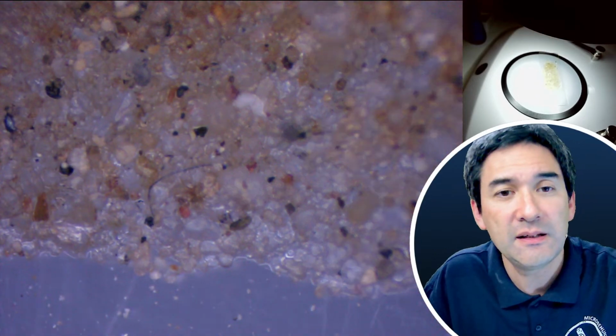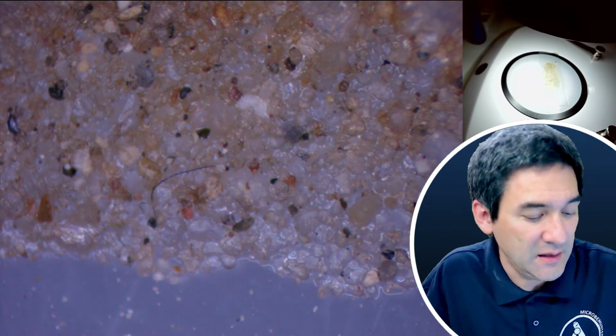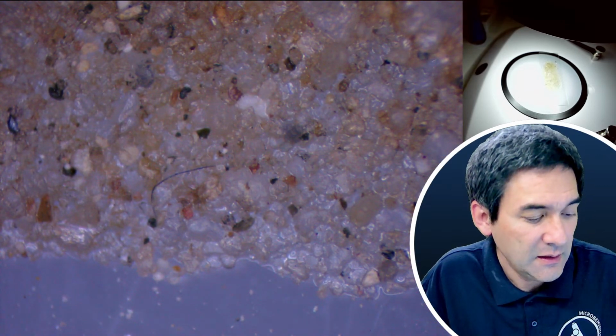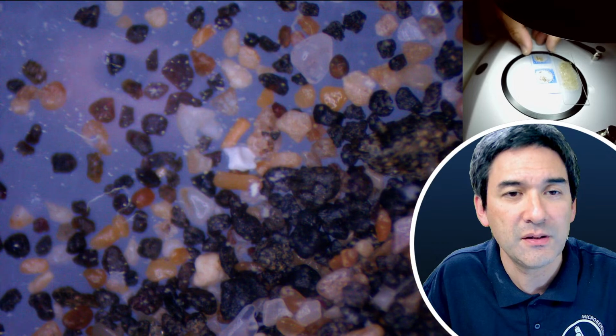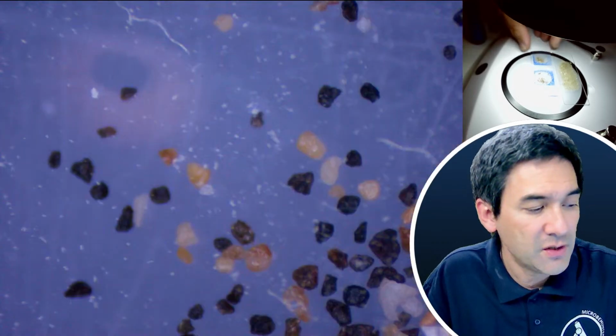And this is not so nice, I think, and therefore I decided that having the sand grains in the more natural state looks actually quite nice. So how are we gonna do that?